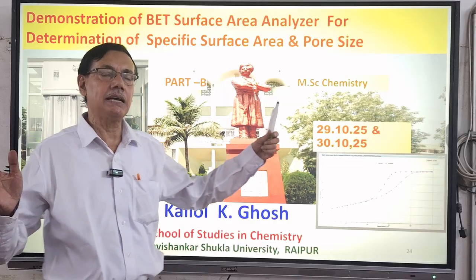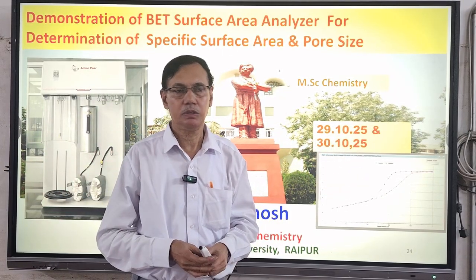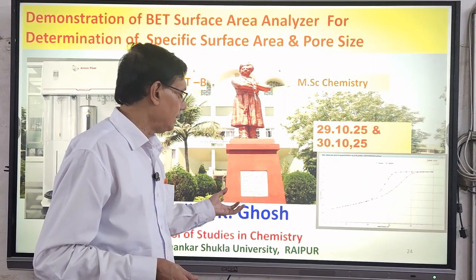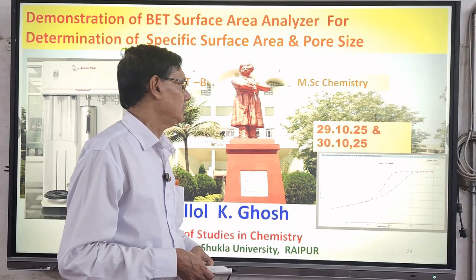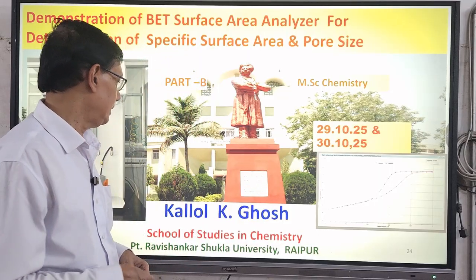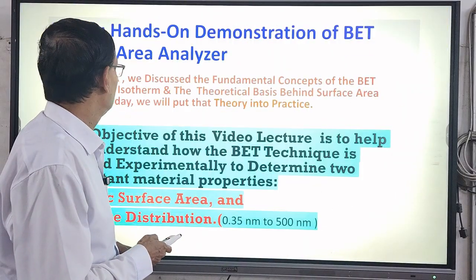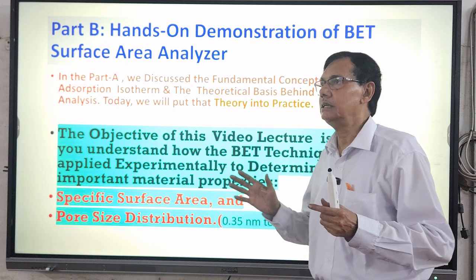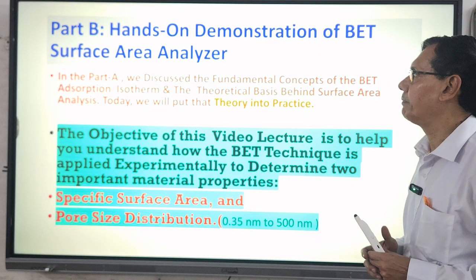Because it is a very lengthy experiment, it will take at least 6 to 7 hours. Therefore, I have prepared some part of the experiment on the 29th, 10, 25, and today we will perform the experiment. And as you know, this is a hands-on demonstration, and Dr. Rajiv Nayan will help me. He will actually perform the experiment.